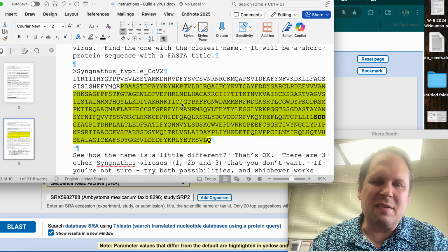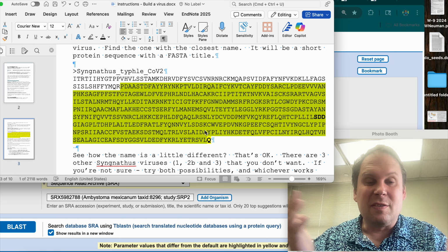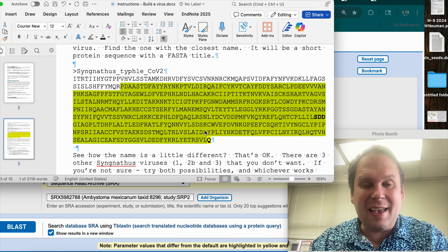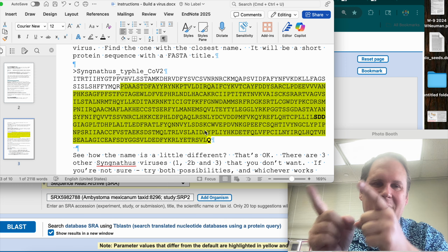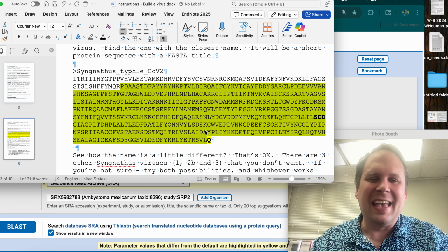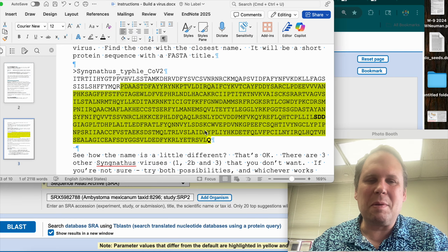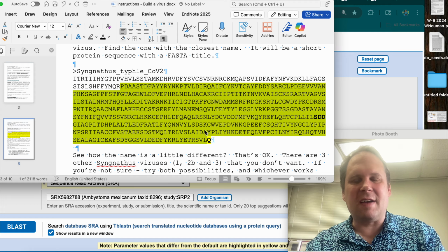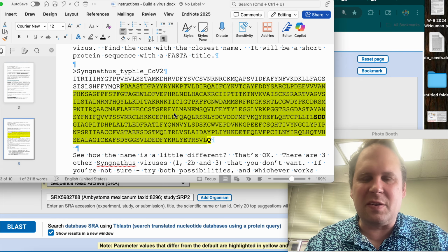I don't think any of these are going to go much above like 35,000, be my guess, but you never know before you build it. So I can't tell you how big it's going to be. I can't tell you anything except if it doesn't have a polymerase, RDRP, it is not a nidovirus. And all of these things have been pre-screened, so we know there is a nidovirus in the data set. We just have not built it yet, and you are doing this.